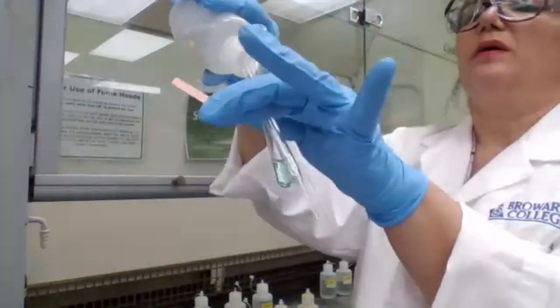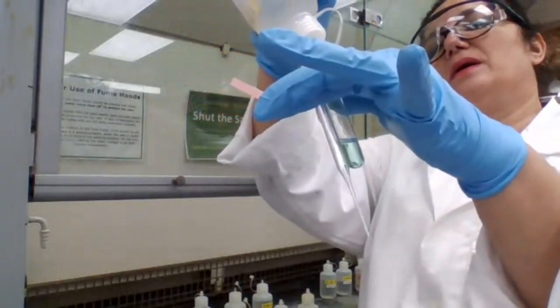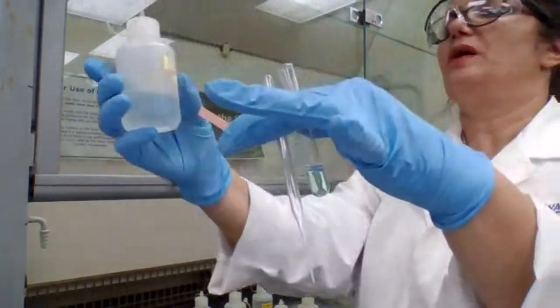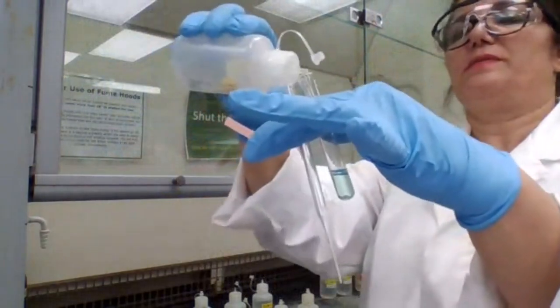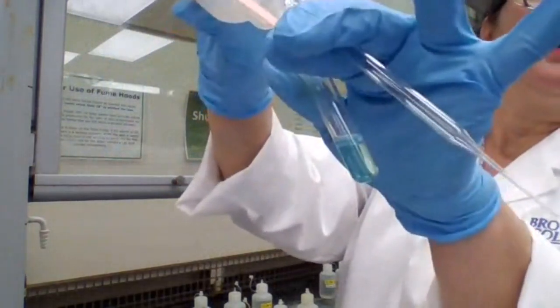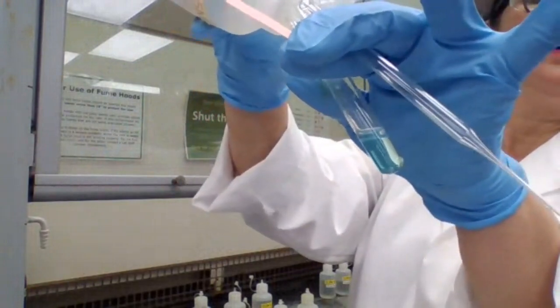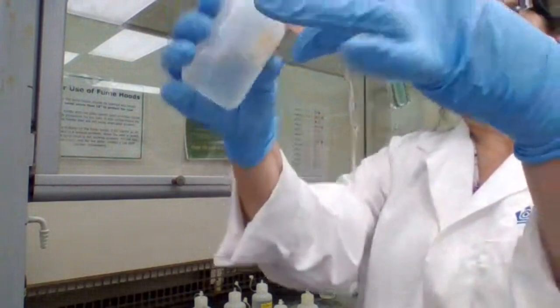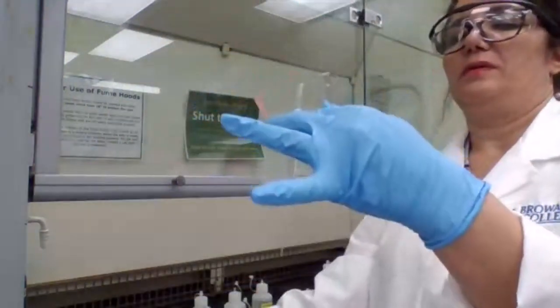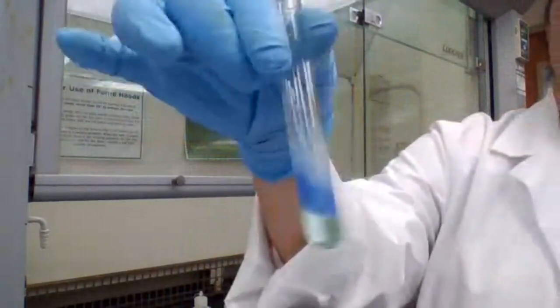Watch what happens when I add it. As I'm adding, you see the top of the test tube is changing color. A blue precipitate is forming.